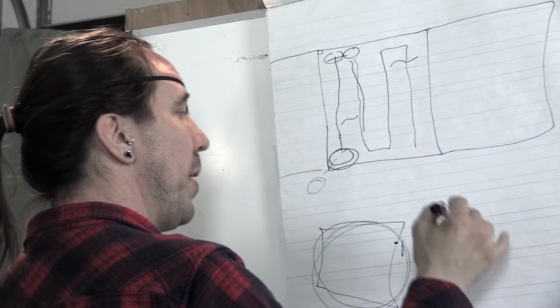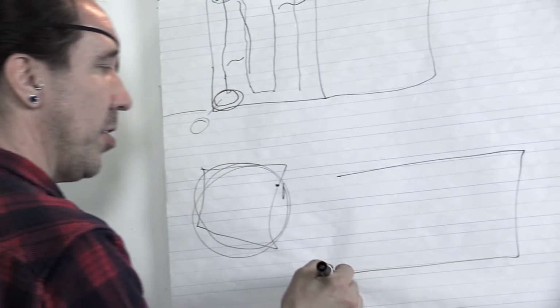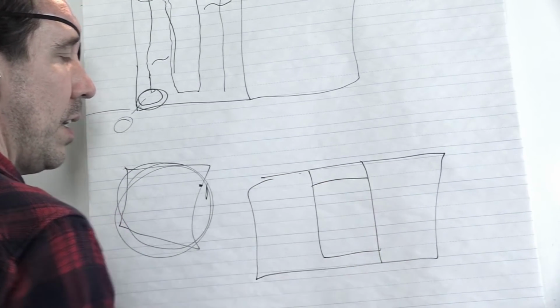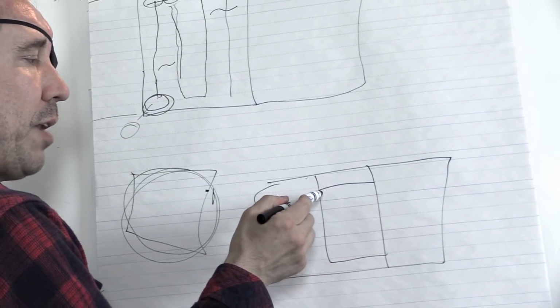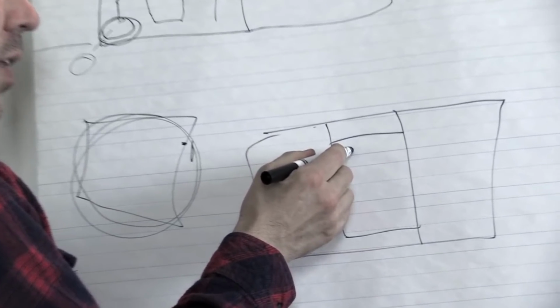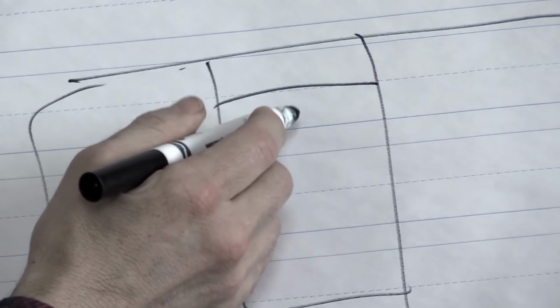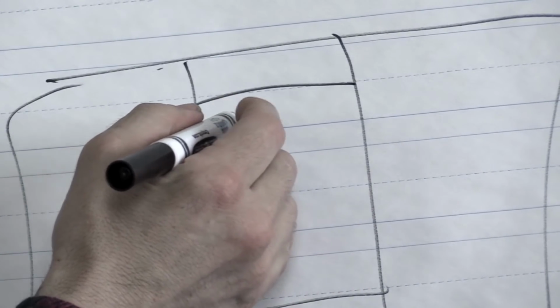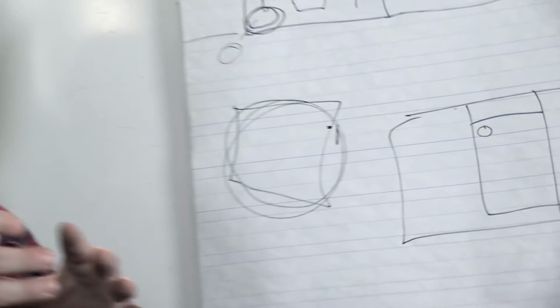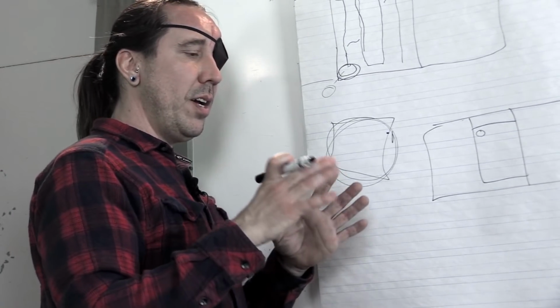So then from here, this is your slide, our slide cover. From here, you can pick, I generally pick 20 points. You can maybe start with 10. You can do up to 100. The more counts that you do, the more fields that you do, the better your averages and means are going to be. So pick a point here, and this is when we can maybe switch back to the microscope in just a second here.